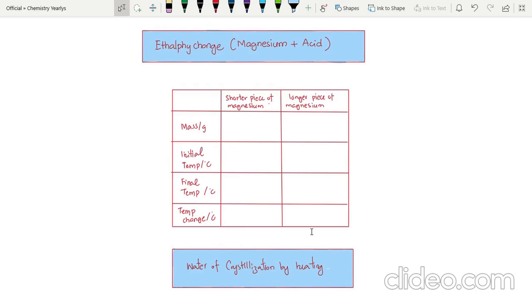For example, if we were adding 10 cm cube of FA2, we were adding 40 cm cube of FA3, and then we increased the FA2 from 10 to 50 and decreased the FA3 from 40 to 10. So this was how we were making it.